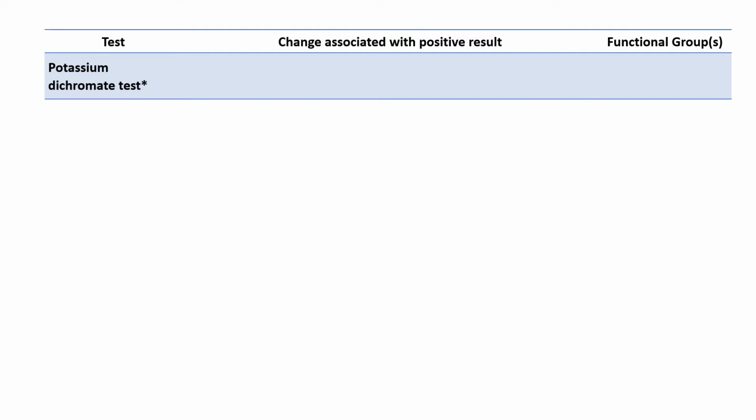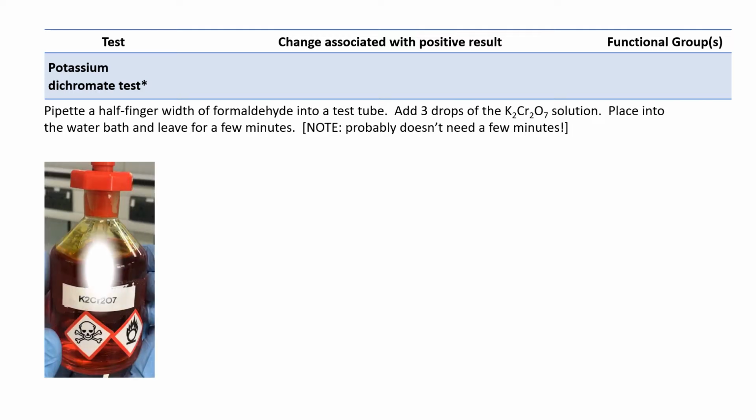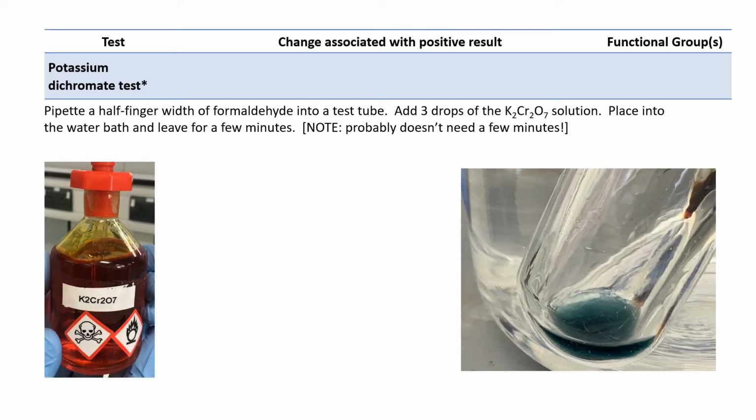So we started off with what I'm calling the potassium dichromate test. This is acidified potassium dichromate. You could have used acidified potassium chromate because the active species in there is often called H2CrO4 or chromic acid. Either way, we've got chromium 6 in an acidic environment. Looks like this, a nice orange color, and a positive result is one in which that orange turns to green.